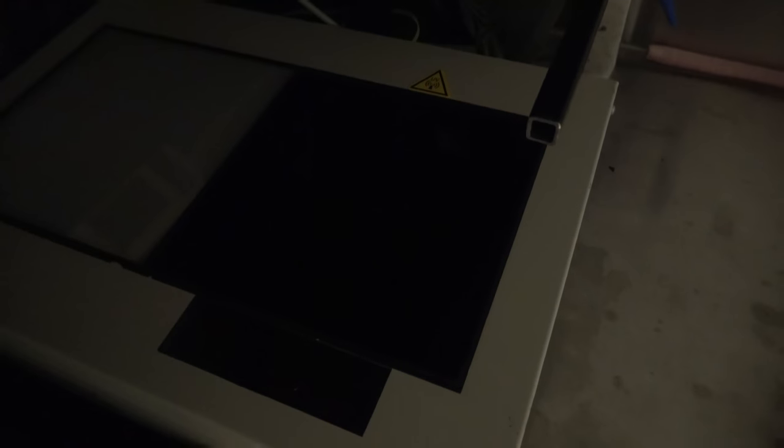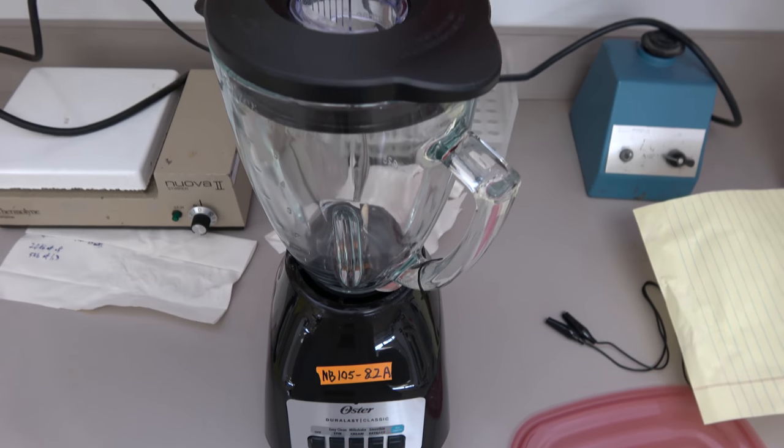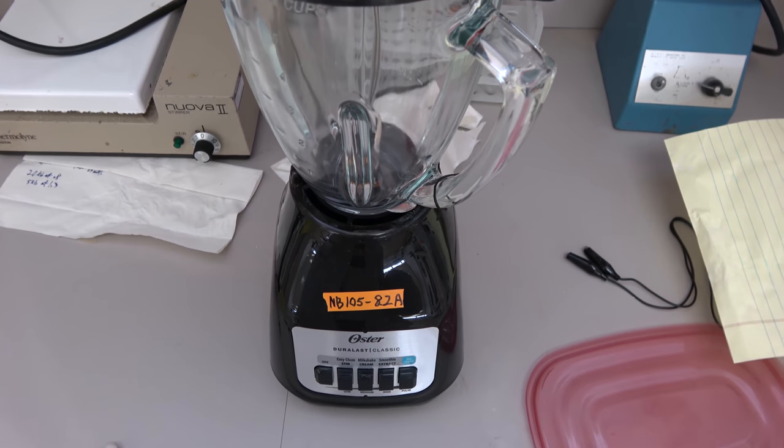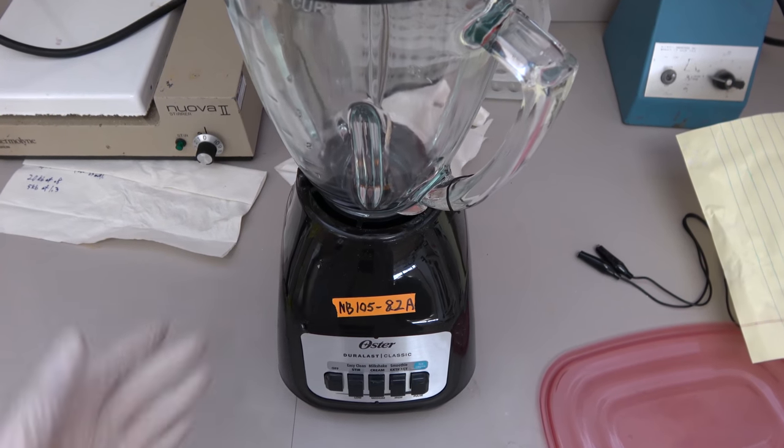Here is a UV light box. Basically it's a source for UV lights and you can see DNA for example in there on a gel. Now, really important safety tip. Whenever you're working with UV light, always fucking put on UV goggles because if you stare at that shit with your own naked eyes you're going to burn your fucking eyes off. We have a blender. Blenders are useful when we want to mix things up.